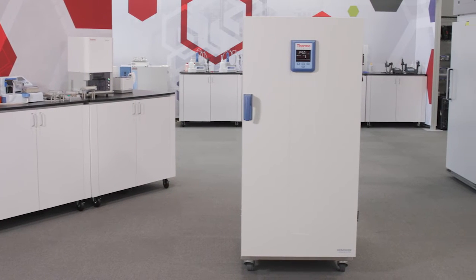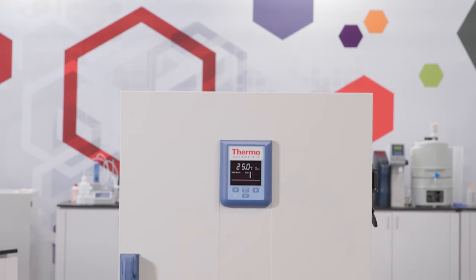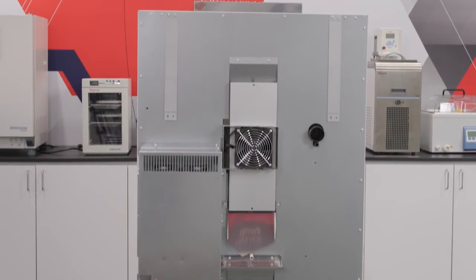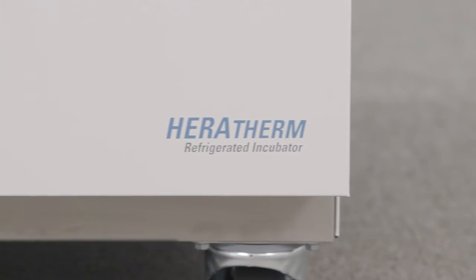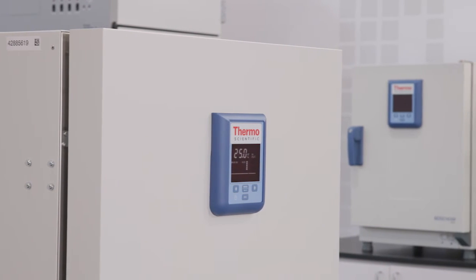Thermo Scientific Heratherm refrigerated incubators provide a refined approach to incubation. Equipped with energy-efficient Peltier technology and a temperature range of 5 to 70 degrees C, Heratherm refrigerated incubators are ideal for applications that demand precision, performance, and reliability.